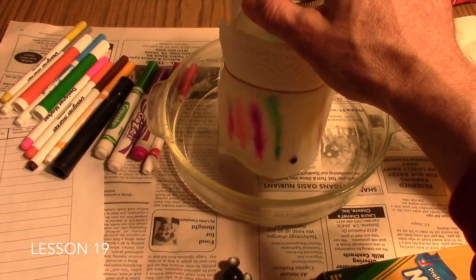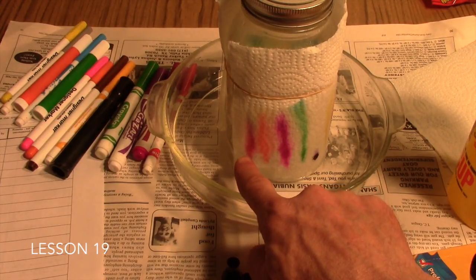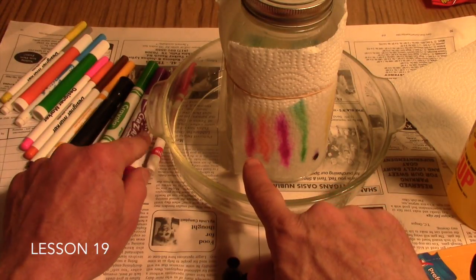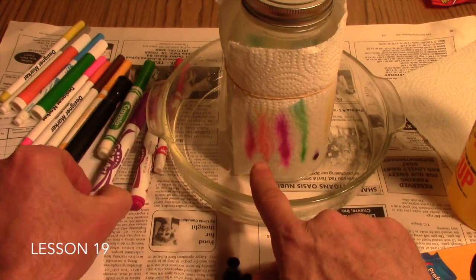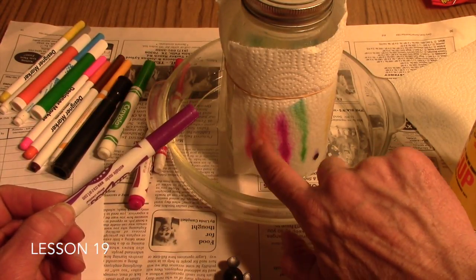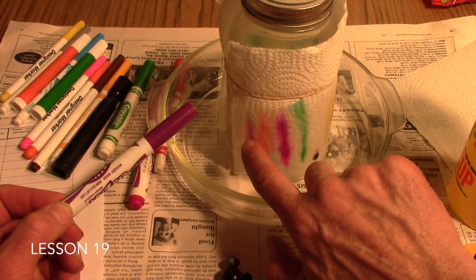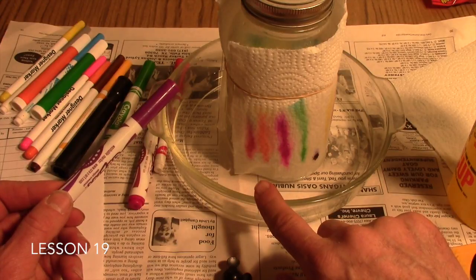And then we have these here. This was that first purple marker that we used, which was this marker right here, and you can see we almost have shades of red, and then we have some blue shades, dark blue violet shades right in there.